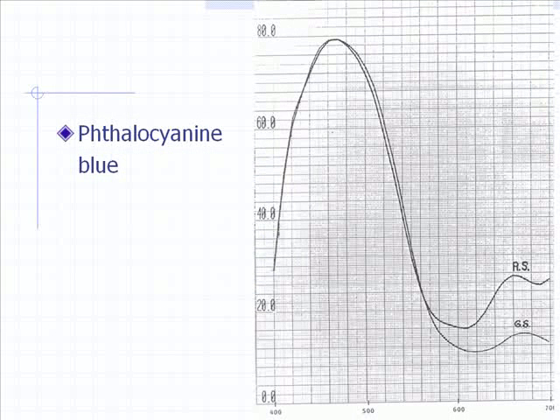Phthalocyanine blue is great in that it's got a really good color to it, very strong, but there's a downside to a lot of these chromatic colorants. When we use them in the lab, for instance, it takes a hell of a long time to clean them out. They linger and linger. And if you don't clean it out, it can contaminate further batches.